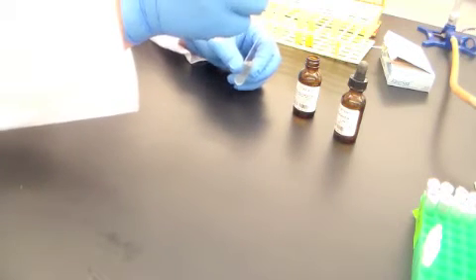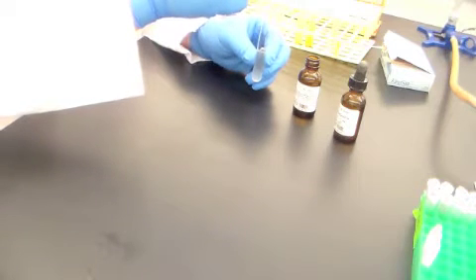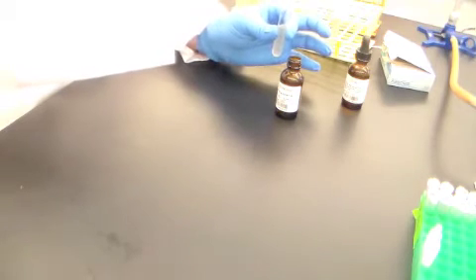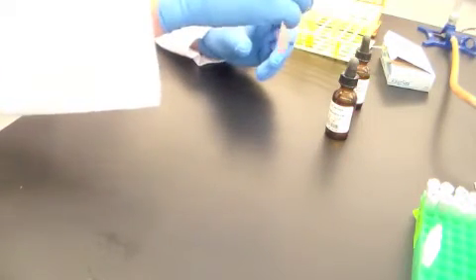So the first thing that we're going to do is add 4 drops of nitrate reagent A. 1, 2, 3, 4. I'll go 5 just for good measure. That's the sulfanilic acid. I'm going to mix that a little bit, and then I'm going to add nitrate B, which is the dimethylnaphthylamine. I'm going to add about the same volume of that. 5 drops. 1, 2, 3, 4, 5. And I'm going to mix that a little bit and set it aside.